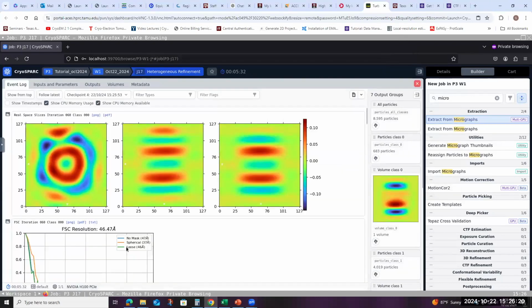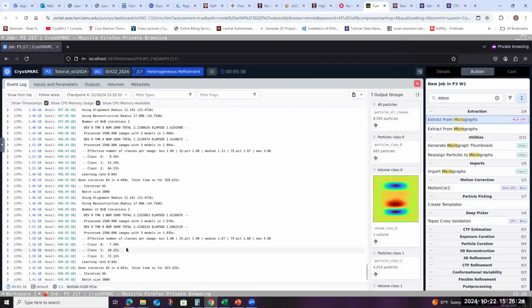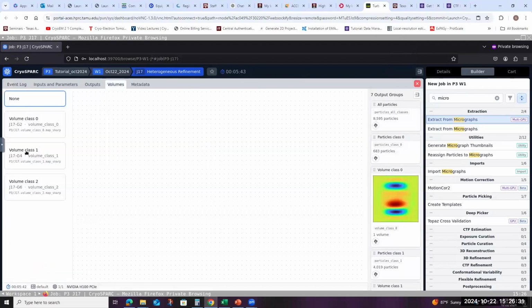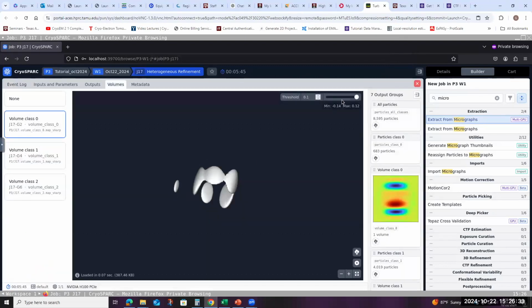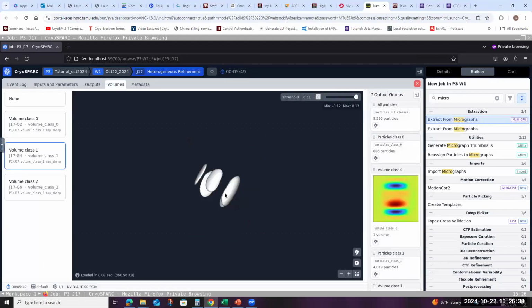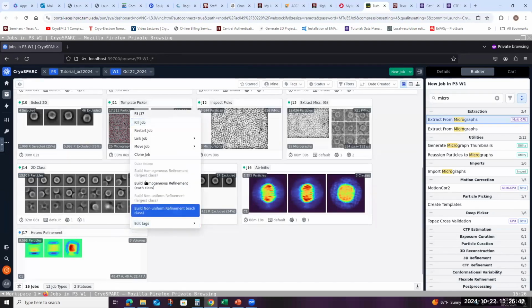Okay, it looks like it's taking too long. Maybe delete. Okay, so I'm going to kill this because we don't want to waste time here.